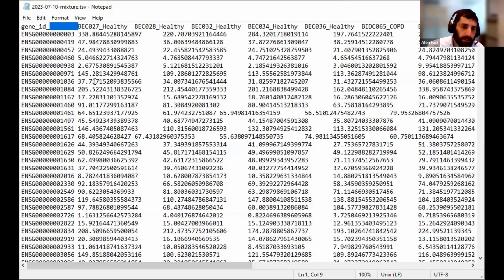There are 2 things that a lot of people forget when they're making their matrix files, and they're the main errors. You must give the Ensembl ID column or the gene ID column, depending on which matrix you're looking at, a name. Doesn't matter what it is, but it needs a name. Otherwise, you will get an error. In addition, you need to know which matrix you're using. If you're using the nose and airway, you need Ensembl IDs. If you're using the lungs, you must use gene symbols.